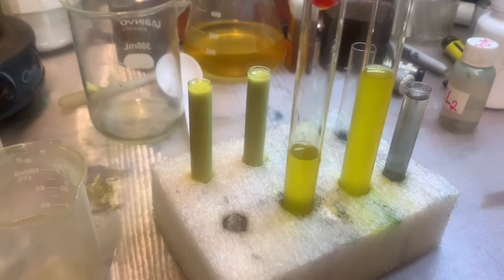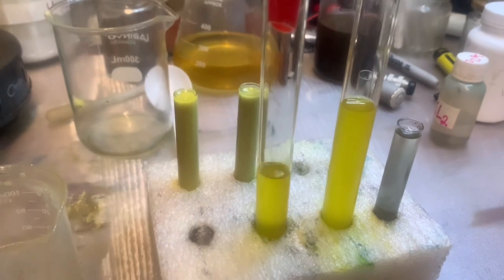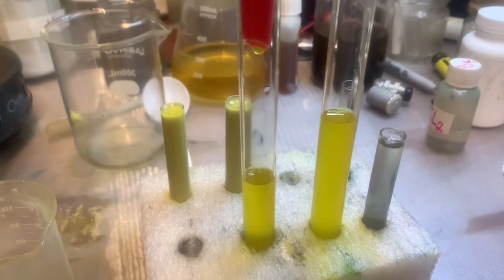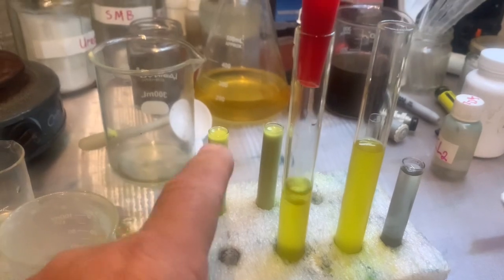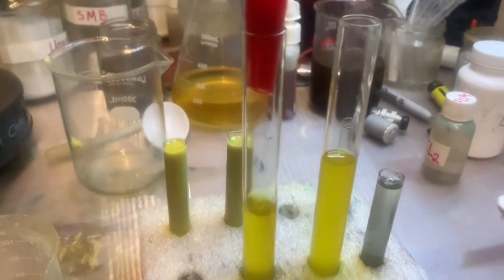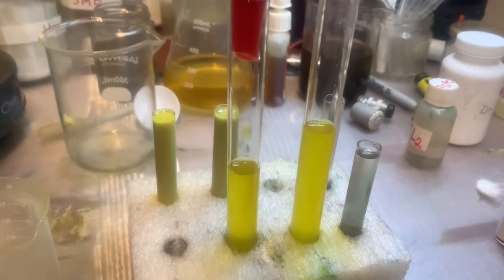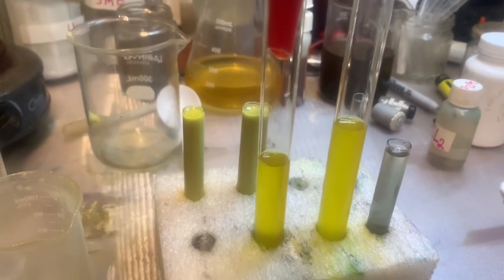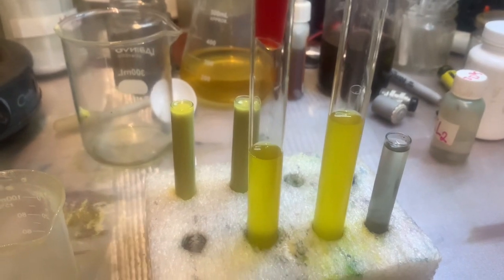You see that even doing colloidal gold, I managed to somehow transfer that colloidal gold together with the silver chloride, and I got them mixed together. But right now they're settling down, so let them settle, and I'll try one more time to filtrate all this solution till I get a little bit cleaner solution, and then we precipitate with the SMB to get the real gold. So this one more time, I'll be filtrating and we will see what we get.